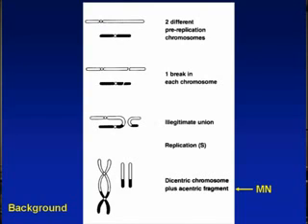If you remember, several months ago we did the chromosome spreading, we all looked under the microscope, we tried to score the dicentric chromosome aberrations. Essentially, micronuclei are a leftover of the other part of the dicentric, and so you can consider the micronuclei as a part of the chromosome aberration method.